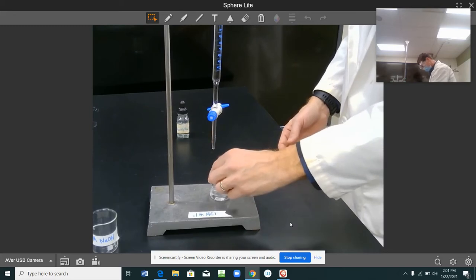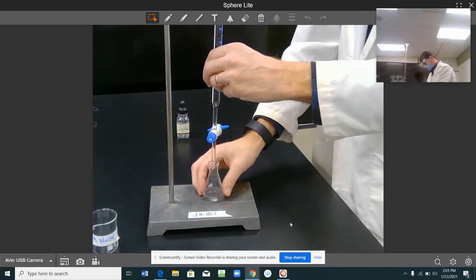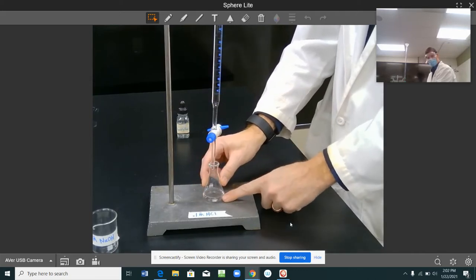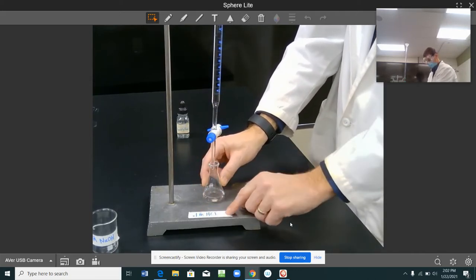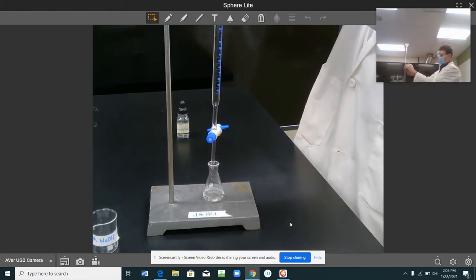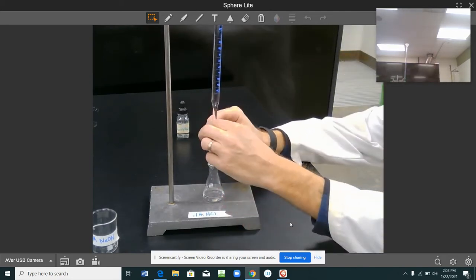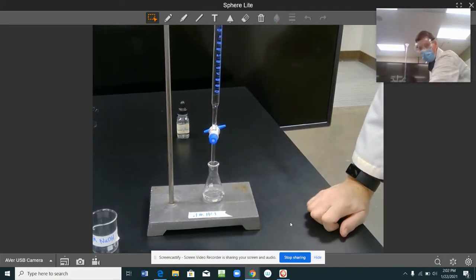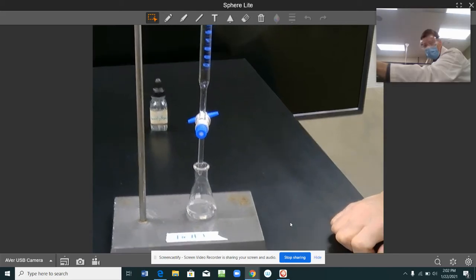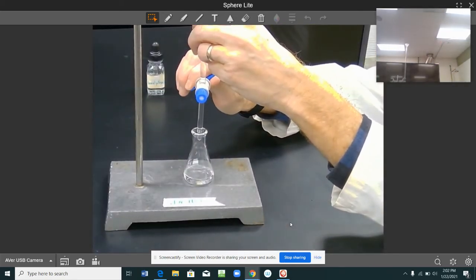So what I'm going to do is go through, and right now I know the volume and molarity of the acid, 0.1 molar HCl. I know the volume I have in here. And we go through, I've got this volume, I record the initial volume, and then I'm going to go ahead and let me zoom in just a wee bit. And start the process of titration.